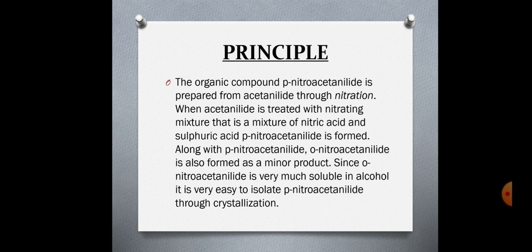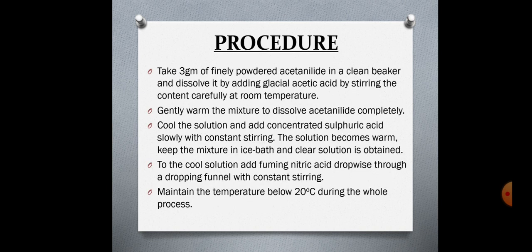Along with para-nitroacetanilide, ortho-nitroacetanilide is also formed as a minor product. Since ortho-nitroacetanilide is very soluble in alcohol, it is very easy to isolate para-nitroacetanilide through crystallization.